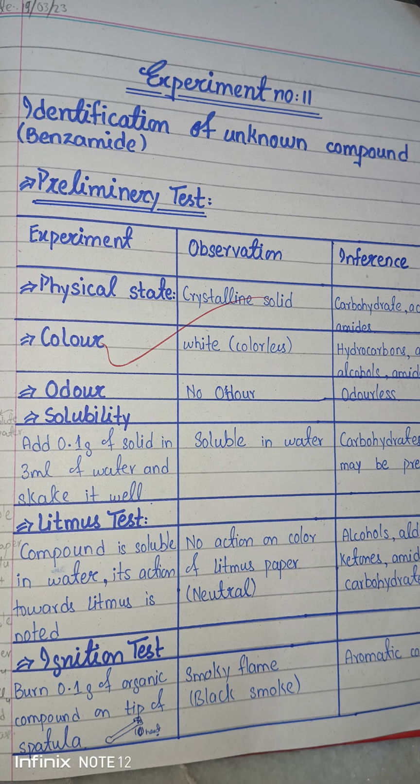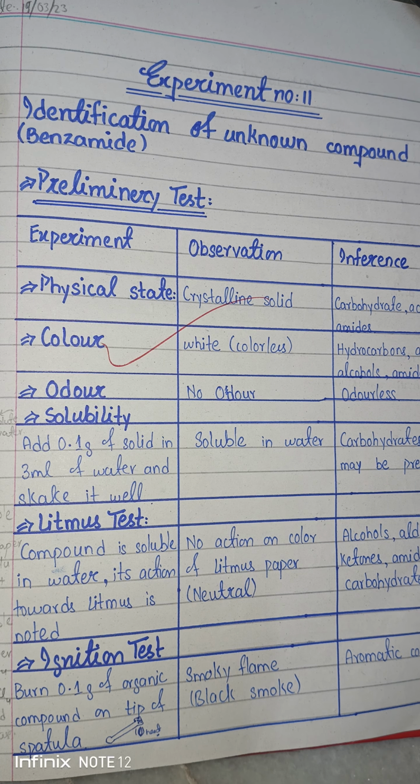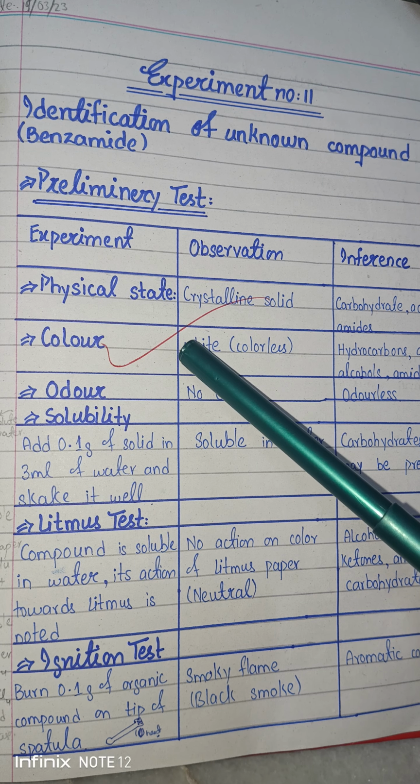But now we are going to discuss the benzamide. Consider in your mind that you do not know what compound it is. So now we perform some experiments on this unknown compound to find out what compound it actually is.